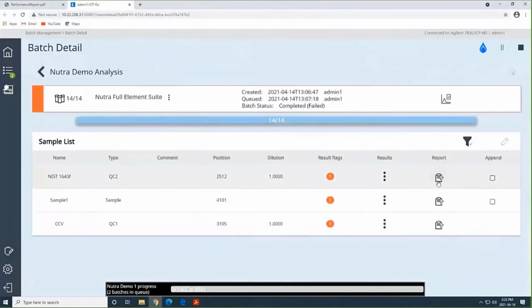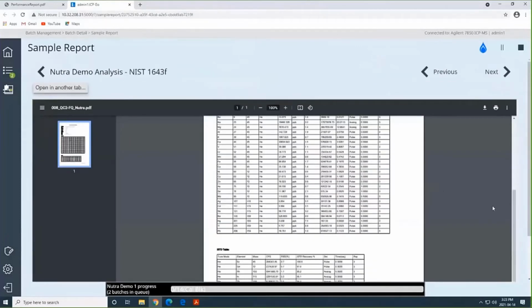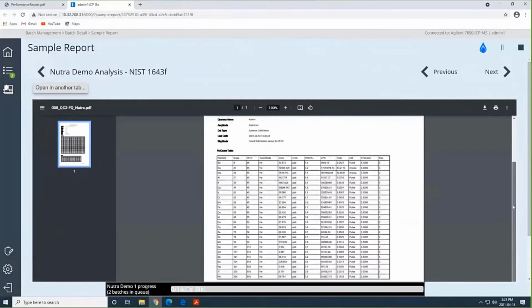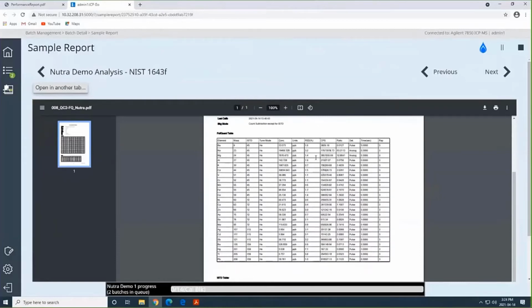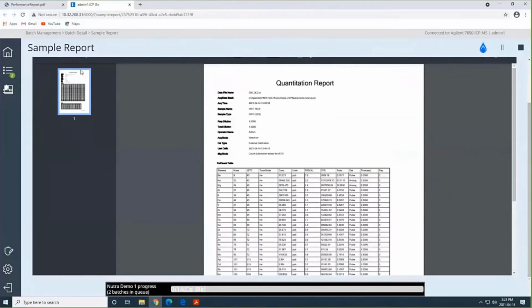If we look at all these samples, we can go back here. Let's go back again, and I want to just look at the associated report. We have a multitude of reports. So this is another way that we can look at this data. I can look through here. We can edit this header. You can add to or delete from the header information. We can also look at the table where we've got concentrations, counts per second, RSD, and so on. It shows us the detector that it used to acquire that data, and it also gives us the internal standard recoveries as well. A lot of companies like to have a PDF report for this, or even a hard copy report, sent to a printer, in addition to the data that you can see displayed within the ICP-Go software.